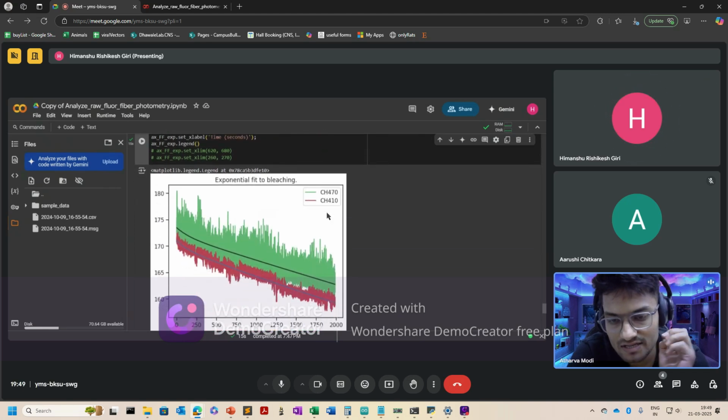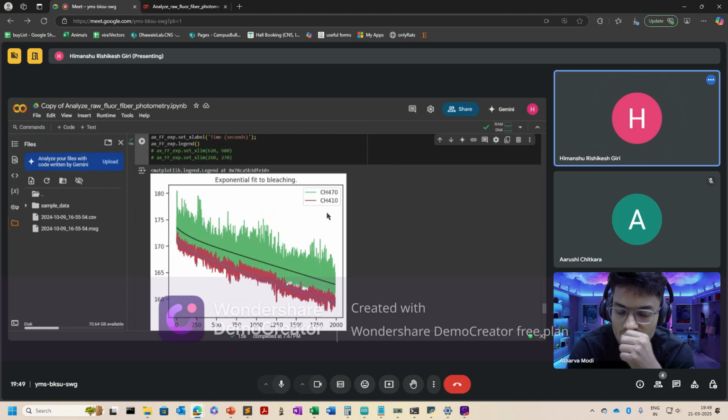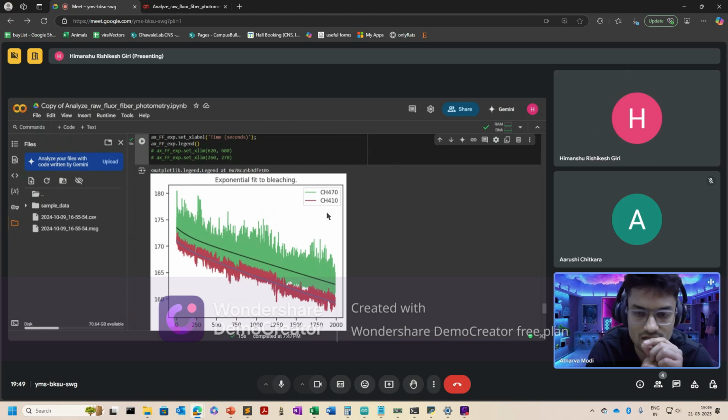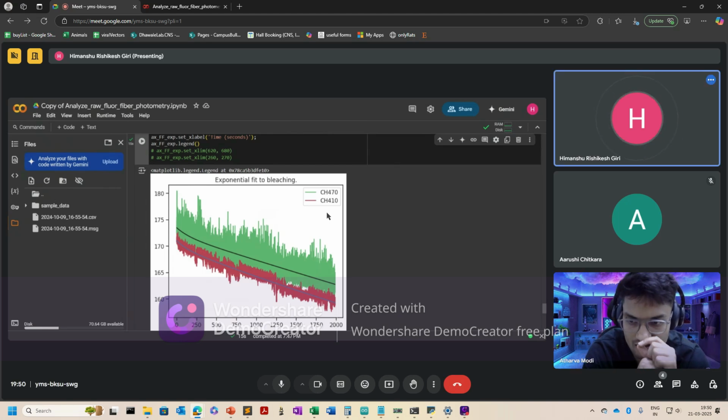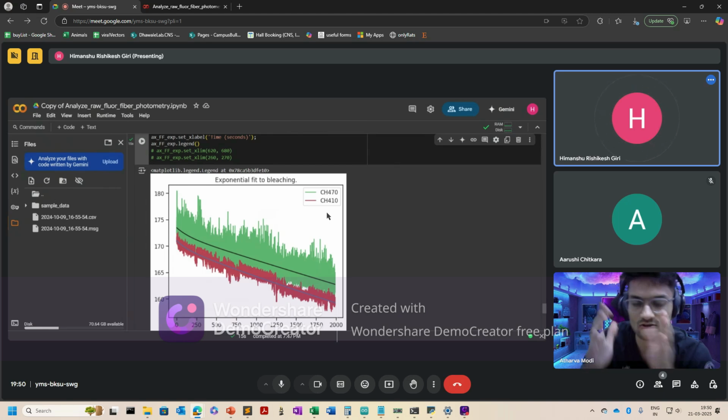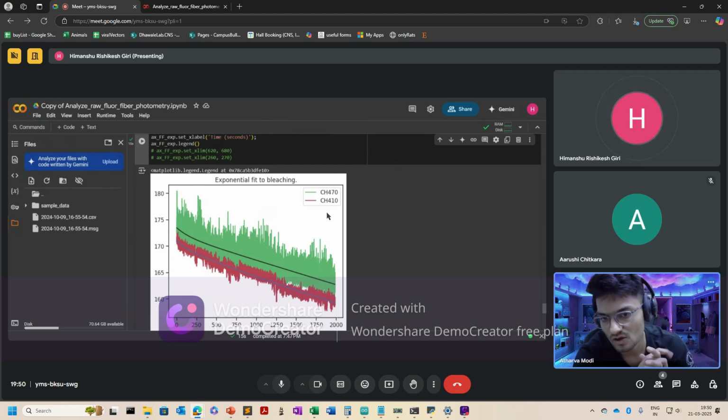So sometimes these step changes may occur because, let's say, you changed the intensity of excitation in between the session. While recording, you realize that this is a noisy signal, then after 15 minutes of recording, you change that. So you have to analyze separate parts, or something may have become loose, which you can't fix while recording, so the signal drops. You can't analyze both the signals together.